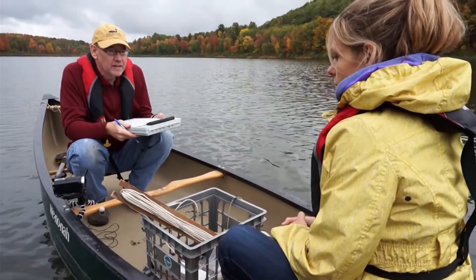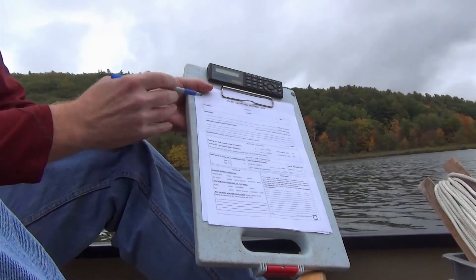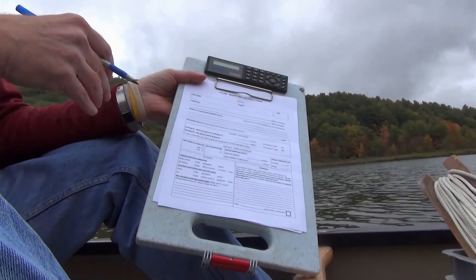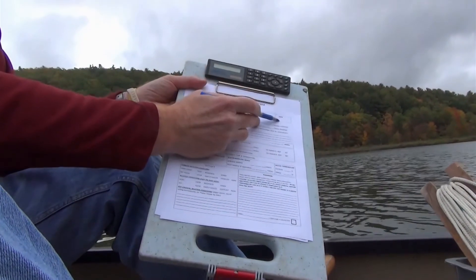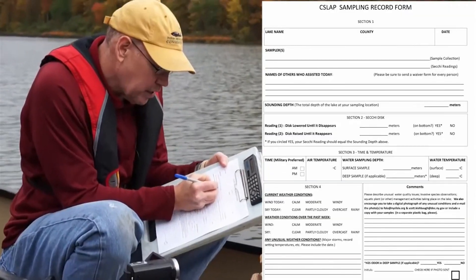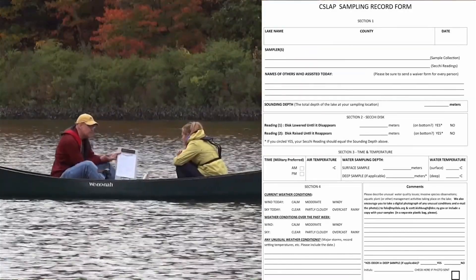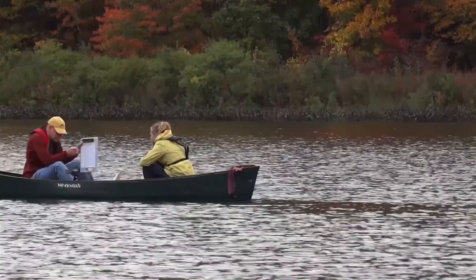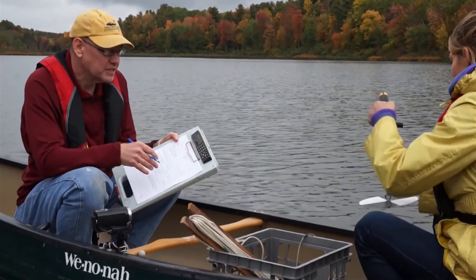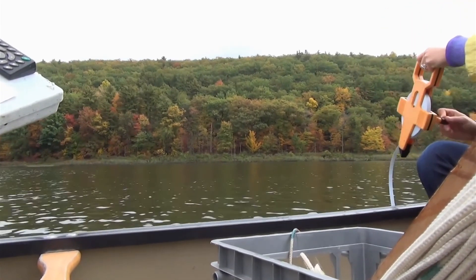We've anchored the boat down and we're now ready to go through the sampling procedures. There are four sections to the sampling record. The first section is writing the name of the lake, the county in which the lake is located — we write the county because sometimes there are multiple lakes sharing the same name, and we want to distinguish those — the date we're collecting the sample, and the names of the samplers. The last step in section one is the sounding depth, which is the depth of the lake where you're doing all of your sampling. We'll show you the procedure for using the Secchi disk to do the sounding depth measurement. You'll take the Secchi disk and lower it over the side of the boat until it sits down on the bottom, and then you'll record that depth.